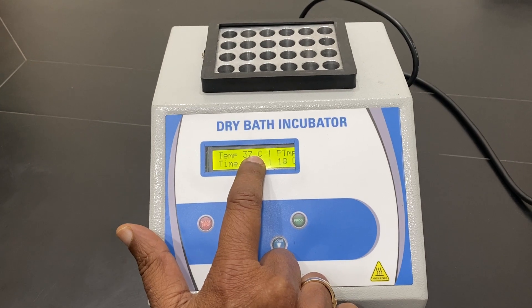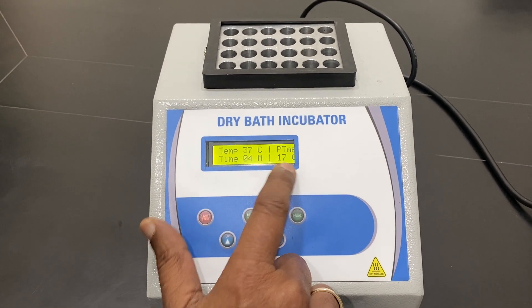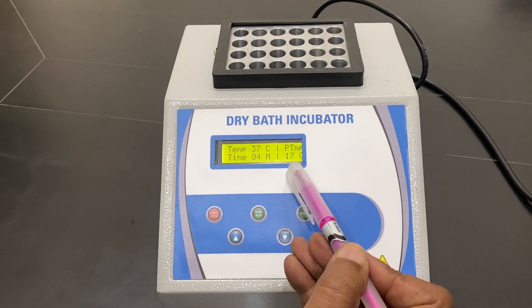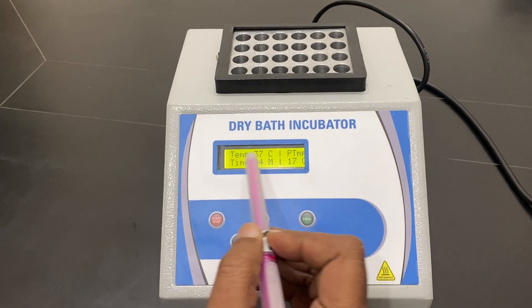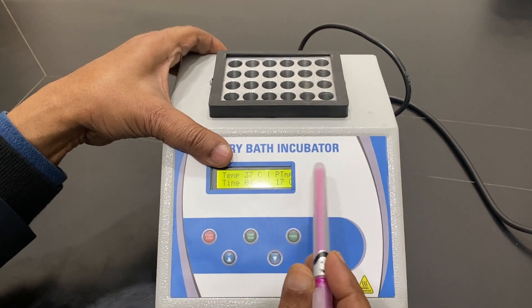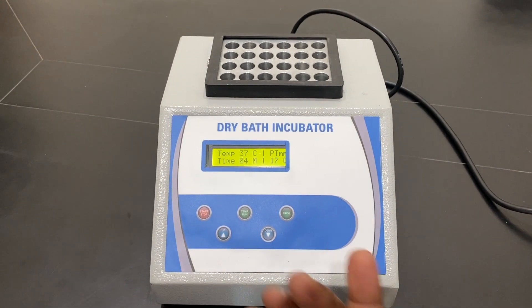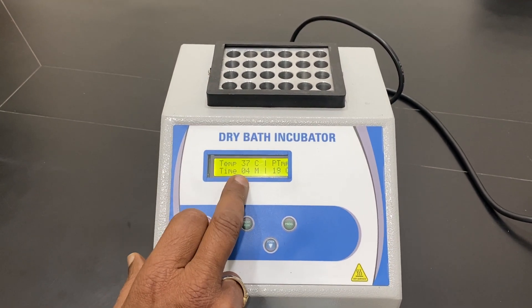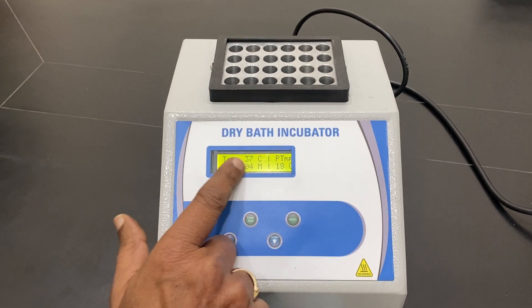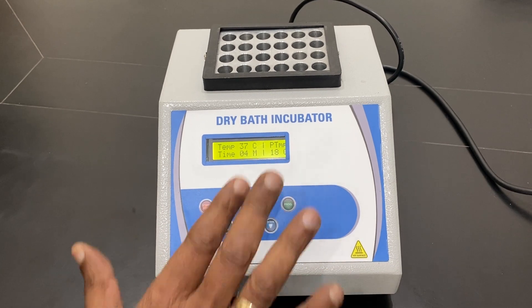Now 37 degrees will be maintained. It is telling you what the inside temperature is — currently 17 or 18 degrees — and the 37-degree heating is going on from the bottom. You can have different blocks for different tubes if you want. Generally it is a 12mm tube, and the time is counting down. Now the temperature is coming up to 37; when it reaches it, it will automatically stop.